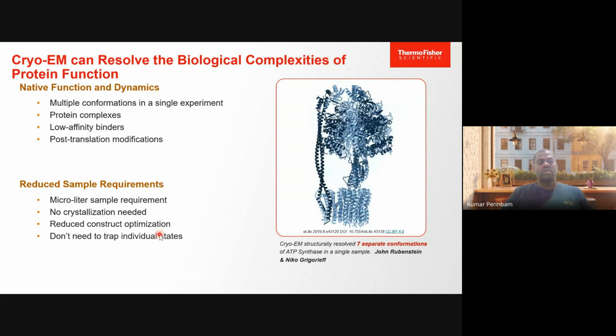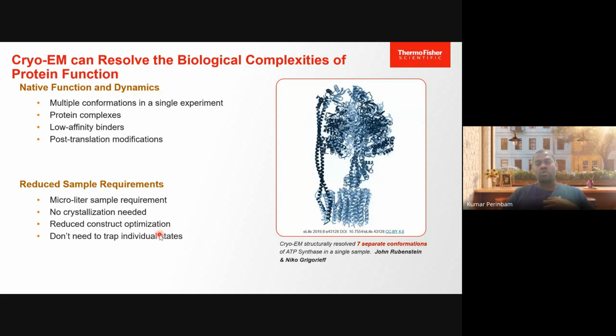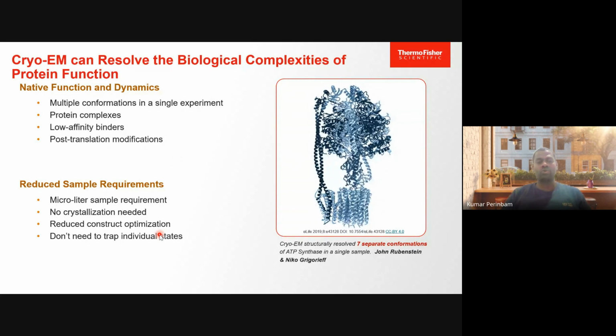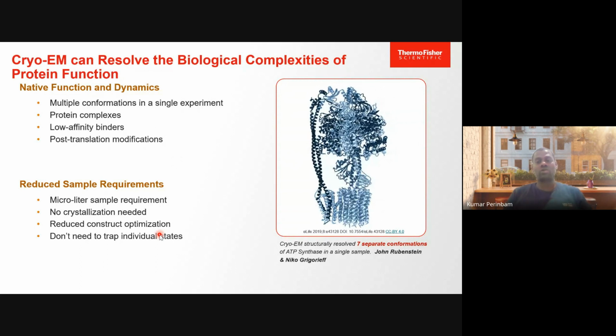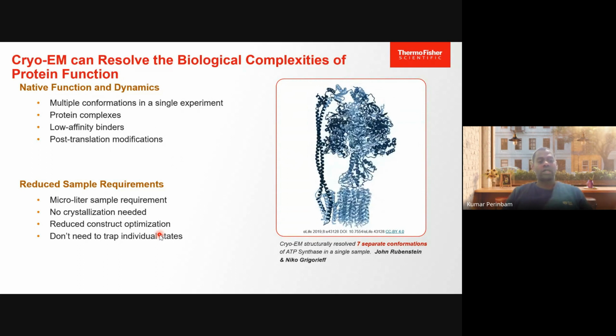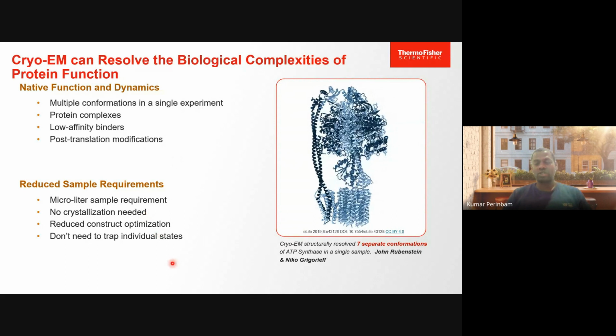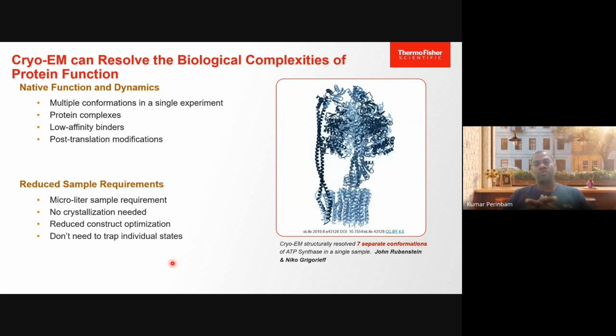So the previous methods were quite difficult for a crystallographer. Although I was a little bit hesitant at first to accept the power of the cryo-electron microscope, I have to agree that it has indeed reduced the time we spend on crystallization, optimizing protein purification, and a lot of other things. So we could get structural information in a very brief time.